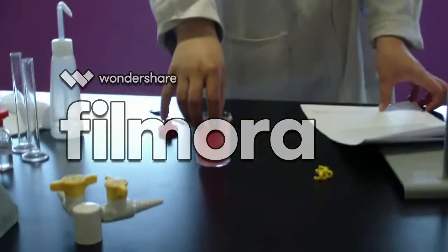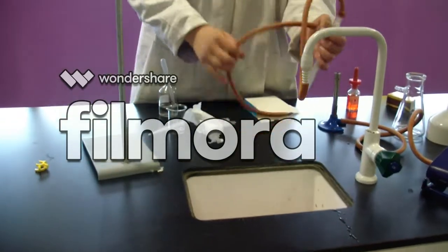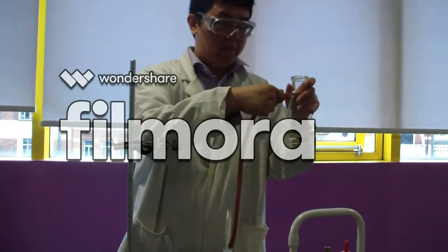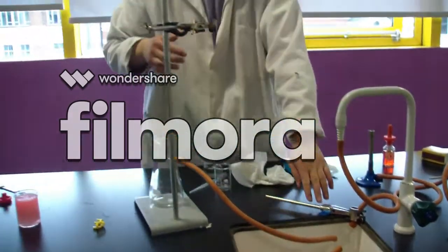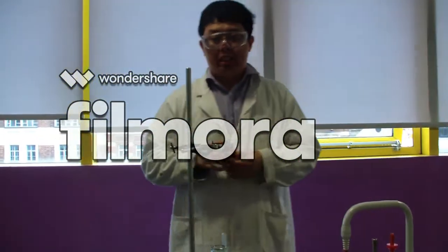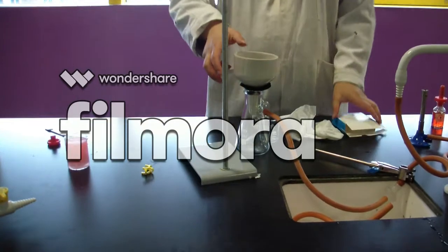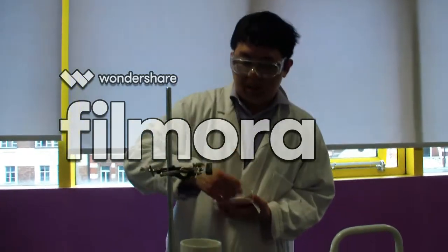Now we just need to get rid of the solution. Place this into the tap. Now I'll put it under vacuum filtration. The clamp is useful to make sure that the water goes into the sink. Okay, I have one of these seals. This helps create a vacuum seal when you switch it on. So, you place this in, and then we place one of the filter papers, making sure that it's big enough to fill the Buchner funnel.